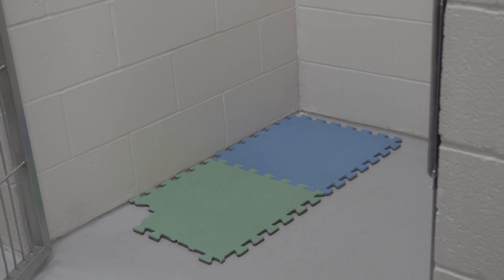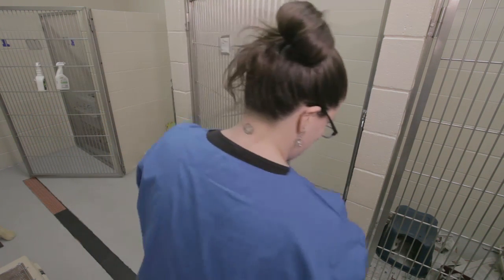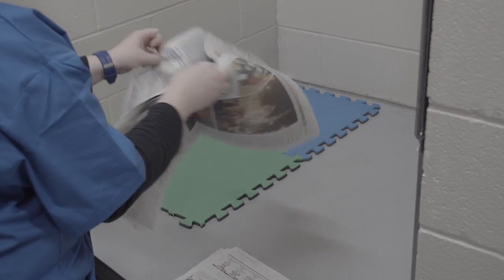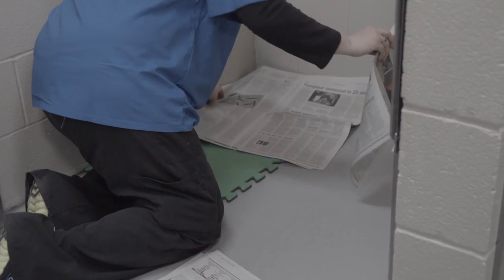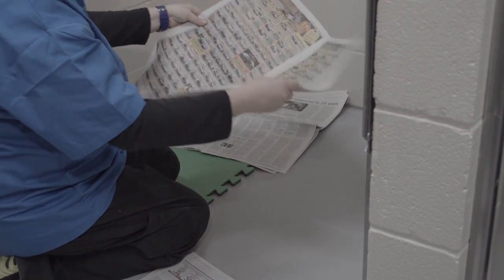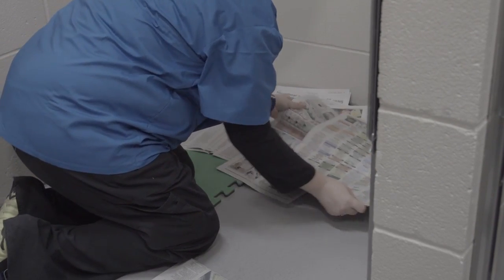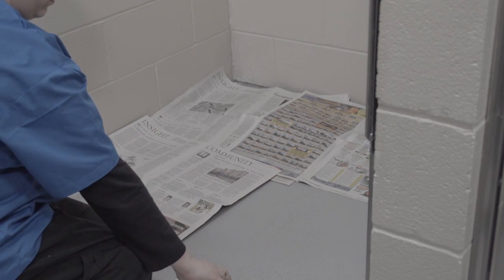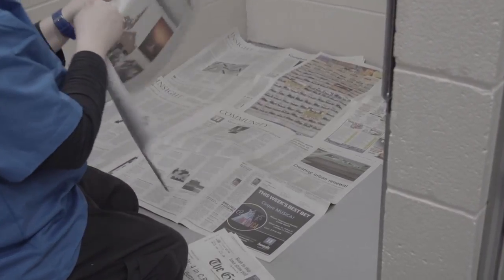And then we line the floor with a couple layers of newspaper. We're going to put the paper on the floor. The paper is going to take care of things a little bit later.